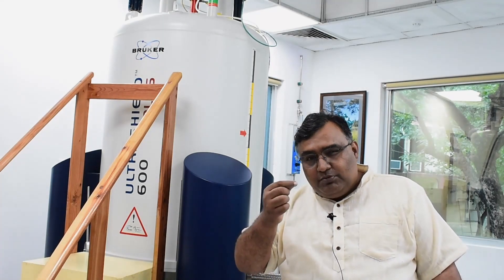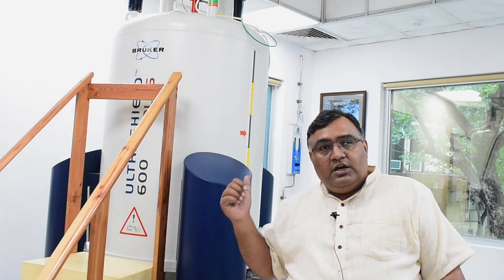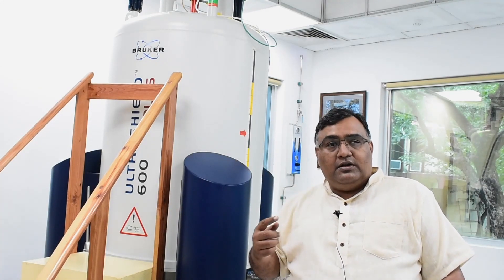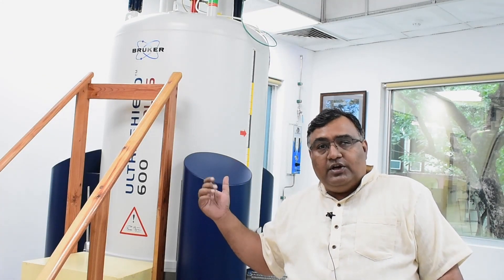They are very thin, extremely thin, thinner than hair coils and they are wound on a barrel. Once you pass electricity through that barrel, you get something called as a magnetic field, superconducting magnetic field.